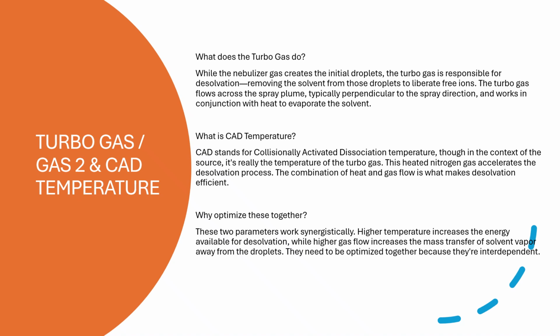Now what is CAD temperature? CAD stands for collisionally activated dissociation temperature. Though in the context of the source, it's really the temperature of the turbo gas. This heated nitrogen gas accelerates the desolvation process. The combination of heat and gas flow is what makes desolvation effective.